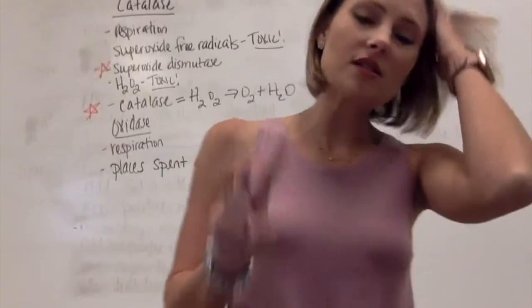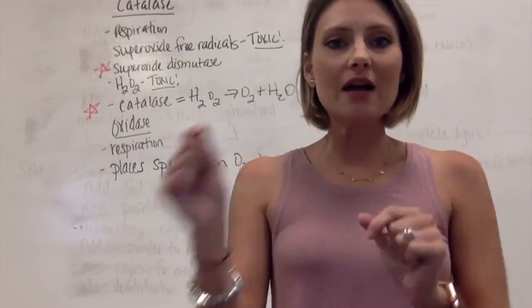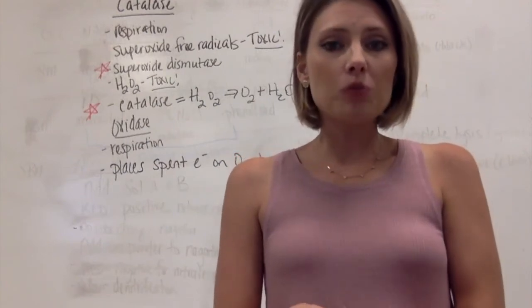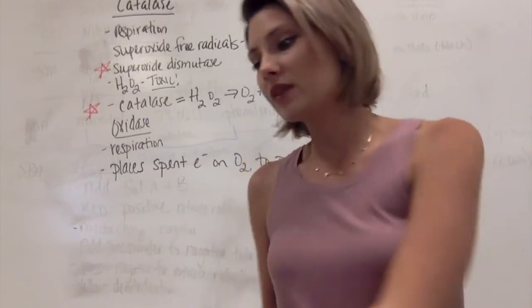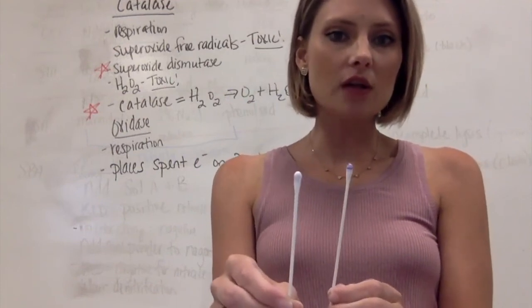Looking for the presence of two different enzymes, both dealing with respiration. Catalase is responsible for neutralizing hydrogen peroxide into water and oxygen. Positive result, of course, is bubbles. Oxidase is responsible for placing the spent electrons onto oxygen, making water. Positive result is a nice dark deep purple. Negative result is no color change on the colony. Okay.